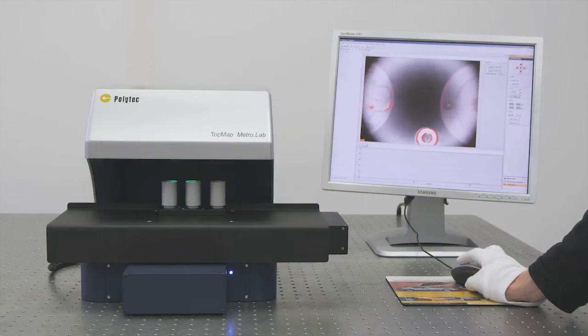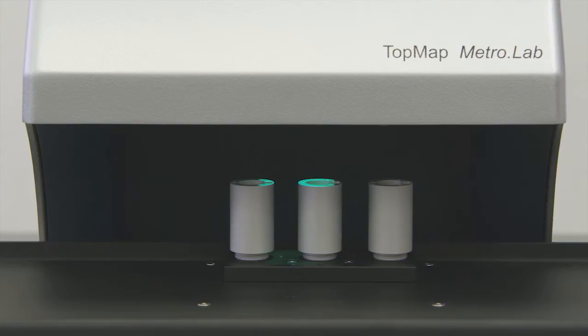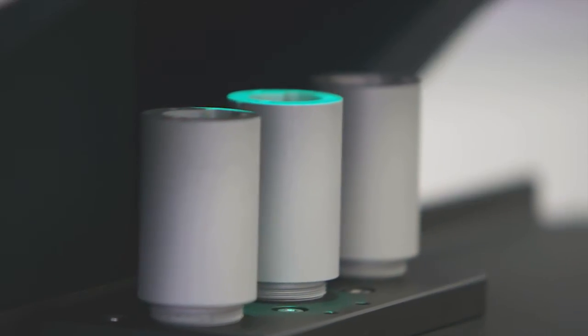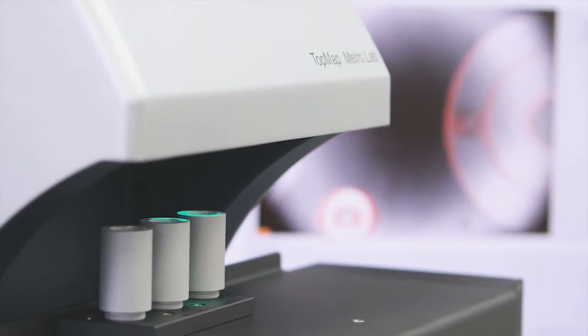For semi-automated operation, positioning devices for pallet feeding are available that allow a standardized measurement and evaluation procedure.